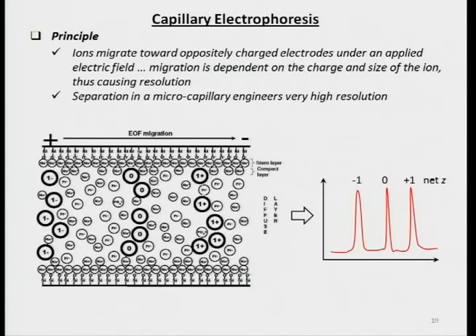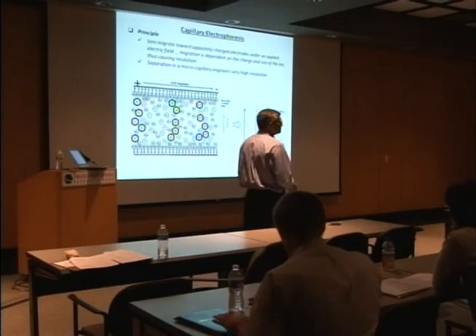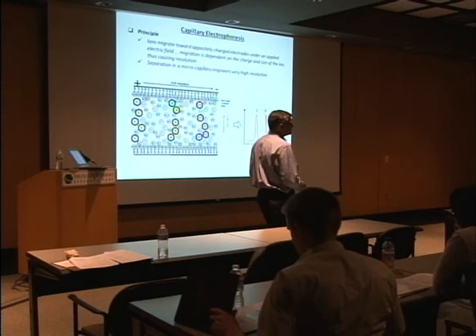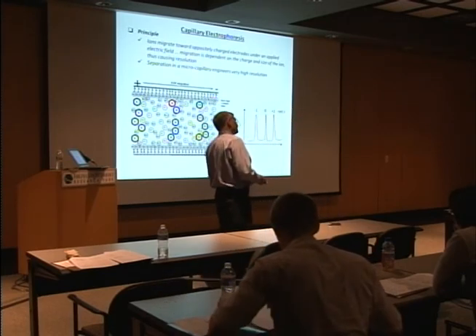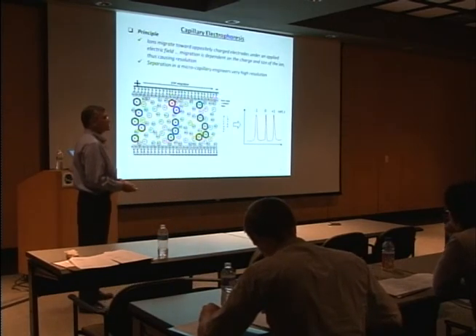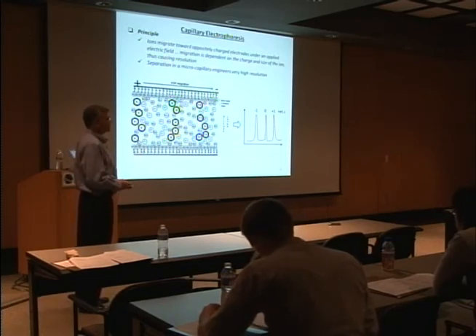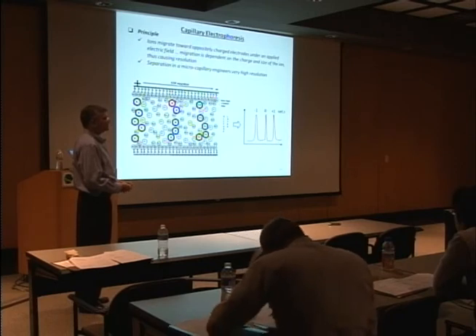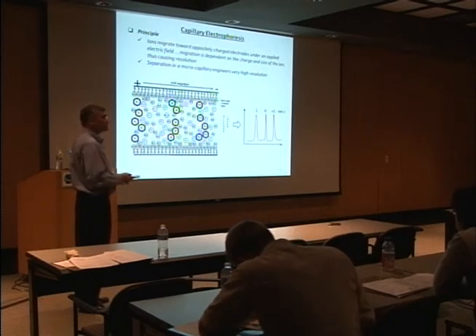So these are in live cell studies. So couldn't some of these results that don't exactly go with what you think is going on be because you attached a giant fluorophore onto the molecule? Yeah, that is always a complication if you attach green fluorescent protein, but those precautions are usually taken. You put in a linker, you separate the modules. The dynamics could change, yeah, theoretically, but no, you have more experience with this.